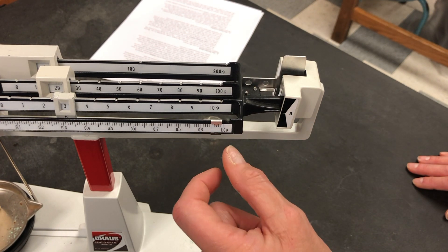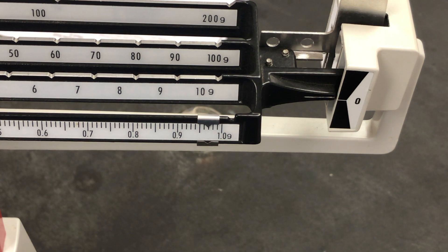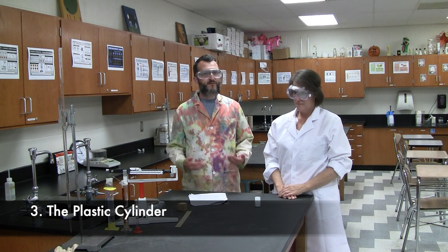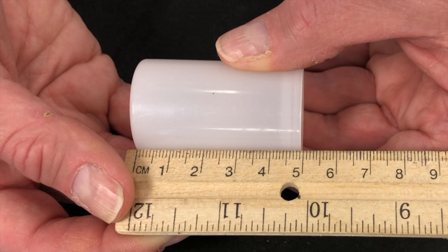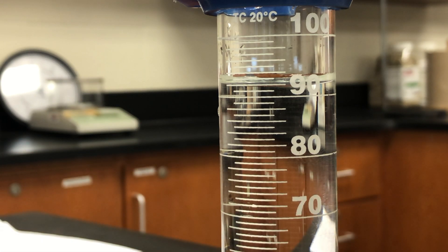Next we're going to measure the mass of the wooden block on a zeroed centigram balance. After placing the wooden block on the pan, balance the scale by moving the sliders. Record the mass of the wooden block in grams — don't forget to add the tenths and the ones. Record the measurement to the accuracy of the scale, estimating an extra digit beyond the smallest increment for proper sig figs.